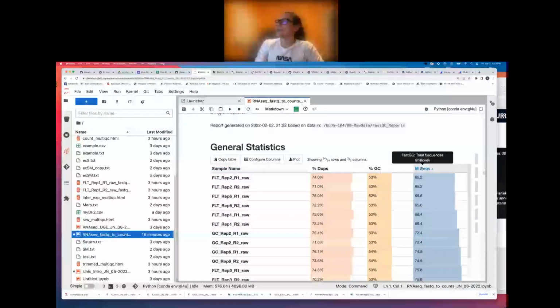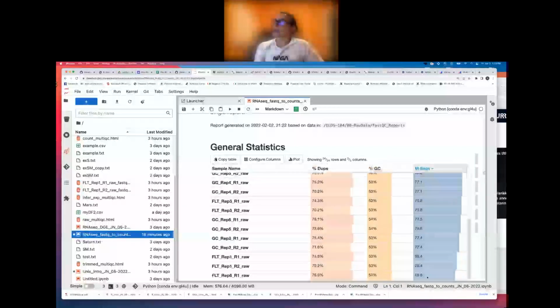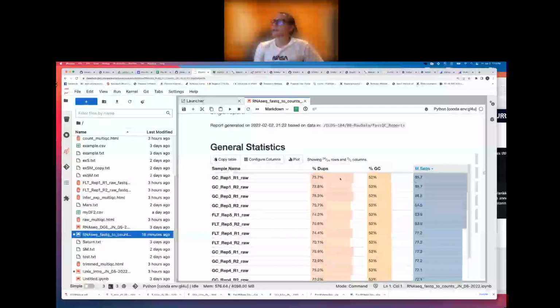If you click on this, it'll sort for you. Right now it's sorted from highest to lowest, and what I see here is that the highest number of reads, the most sequences, is in our ground control rep 1. A lot of you got that. Also note that for R1, the forward read, and the reverse read, you see the same exact value. It should be that way for every single sample, because it's one cluster that we're sequencing in one direction and then the other direction. So ground control rep 1 is the right answer for the most reads.